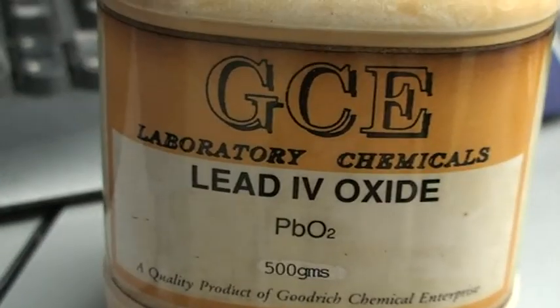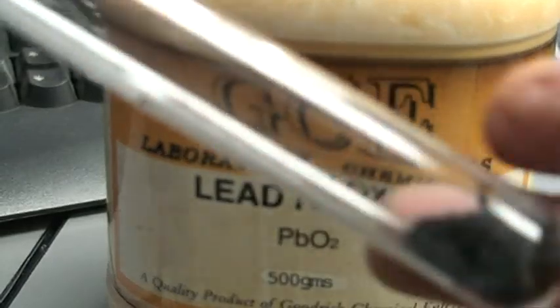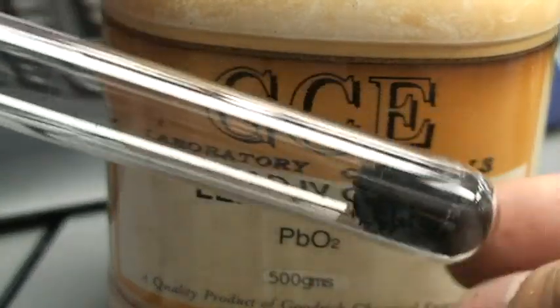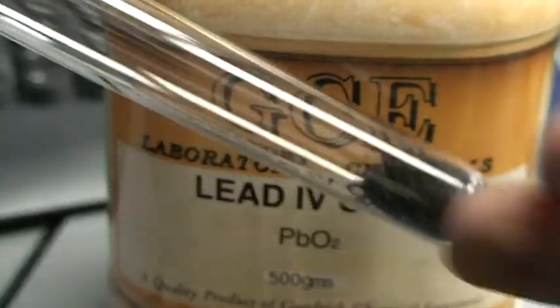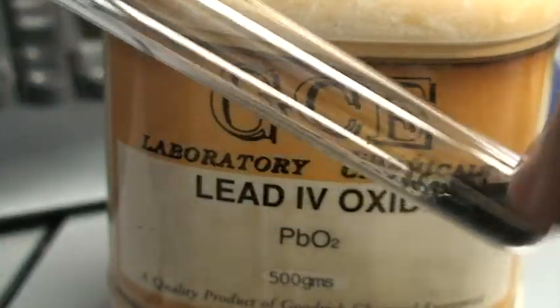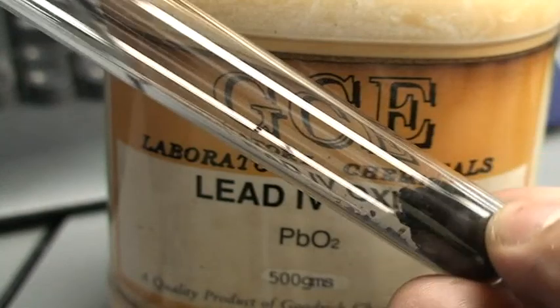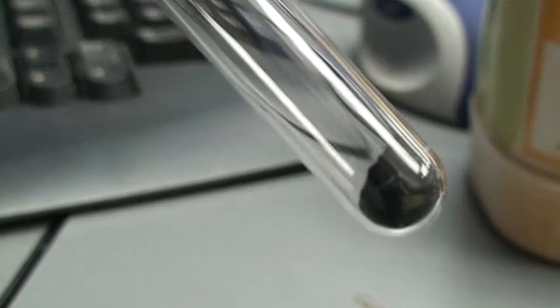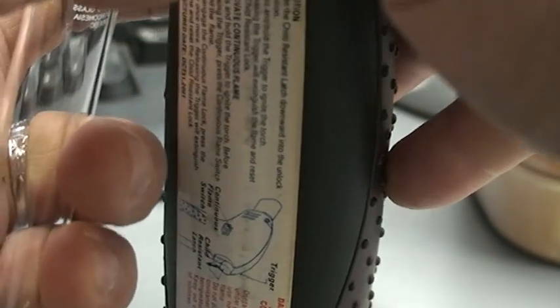What we're going to do is take a bit of lead(IV) oxide and heat it. We might not have time to show all the preparation because we need to do some calculations. So what I'm going to do now is heat this using a flame.